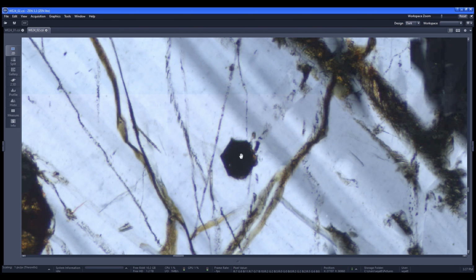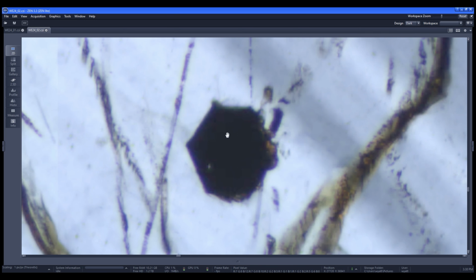And in a microscope, you can use this to do some really cool things, optical properties with it, to do some mineral identification, which might be something I can get into in a future video. But it's basically how you would tell if a mineral is uniaxial or biaxial. And maybe, if you're curious what that even means, I'll leave that up to you to do some online research.